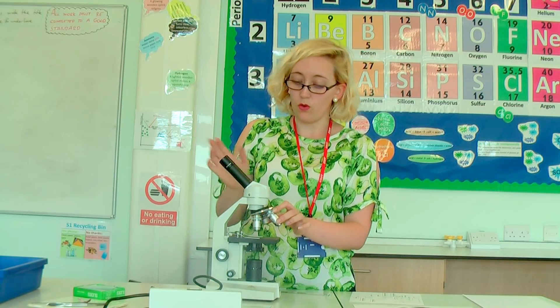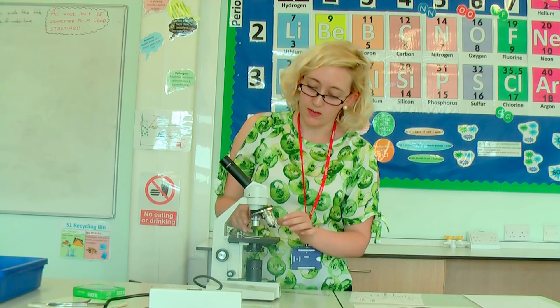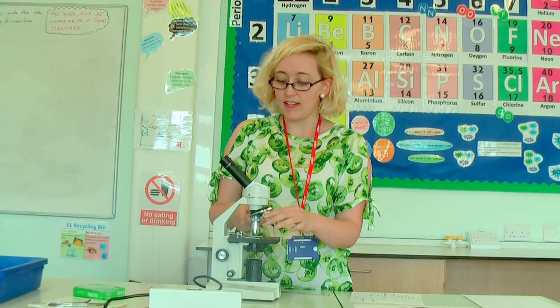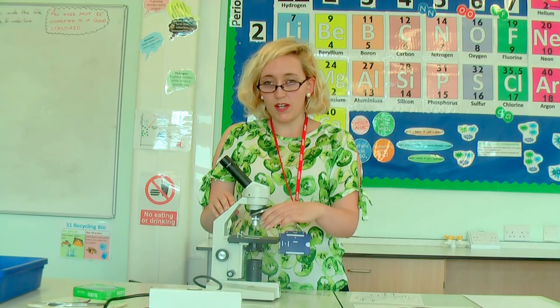Adding the objective lens magnification together with the eyepiece lens: if I'm using the red lens, that's 3 times 10, so 30 times total. If I'm using the yellow lens, that's 10 times 10, which is 100. And if I'm using the 40 times lens, that's 40 times 10, which is 400. Those are my lenses — they're easy to rotate between. In general, we start with the red one and then move up to get more focus.